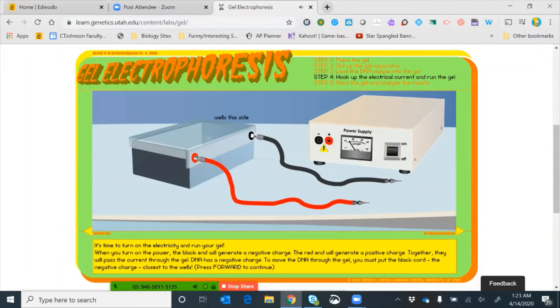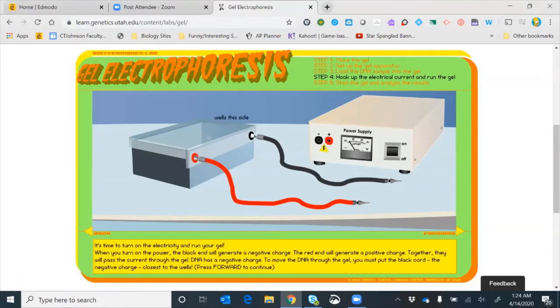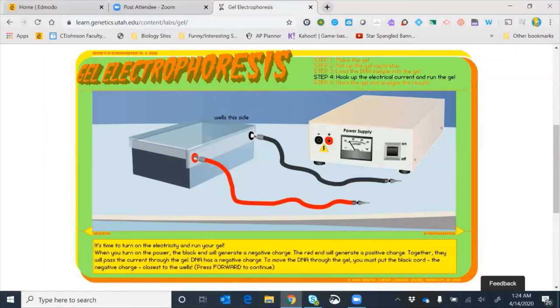Now we're ready to set up the power supply, connect everything, and run electricity through the gel. When you turn on the power, the black end generates a negative charge and the red end generates a positive charge, passing current through the gel. DNA has a negative charge, so to move it through the gel we must place the black cord — the negative charge — closest to the wells.